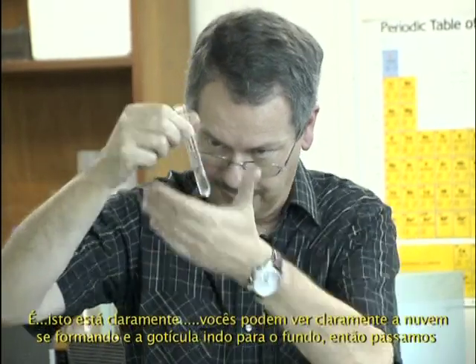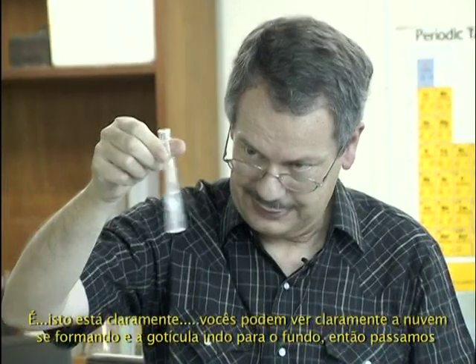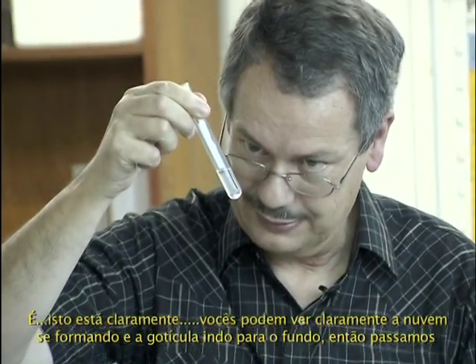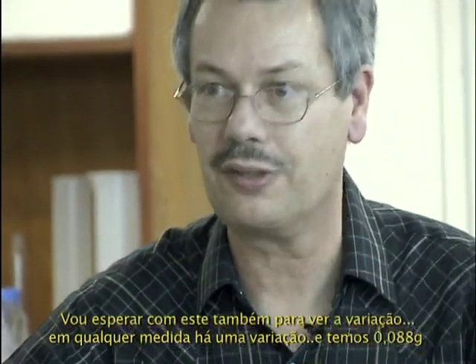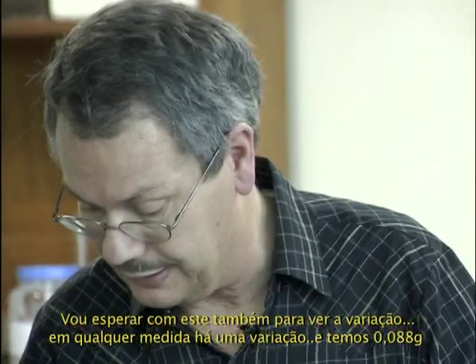Yeah, this is clearly making, you can see the cloud forming and the little drop goes down. So this is past. I'll weigh this one also to see the variation. Any measurement, you have a variation. And this is 0.088.